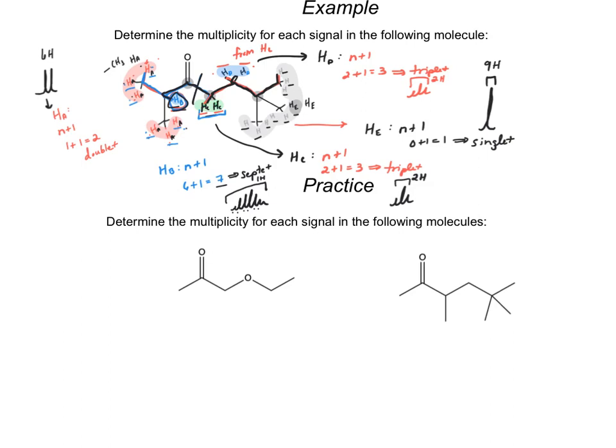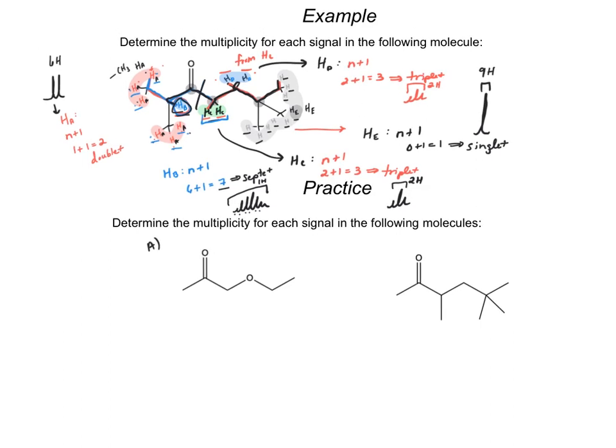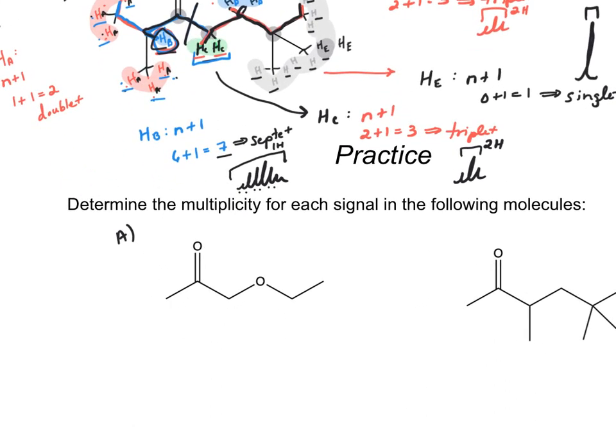Okay, so we'll start over here with the first one on this guy. We'll start out left. We do have protons out here. These are methyl protons, so these guys are all going to be equivalent with respect to one another. And again, we'll call this signal HA.